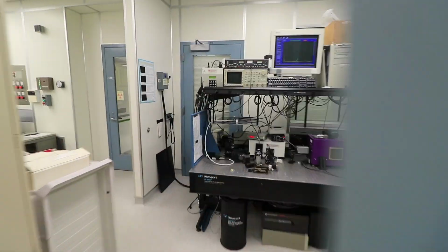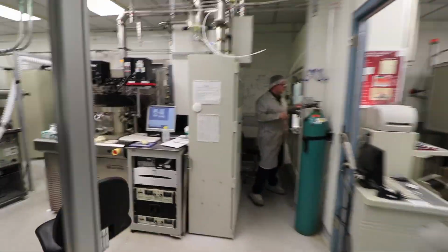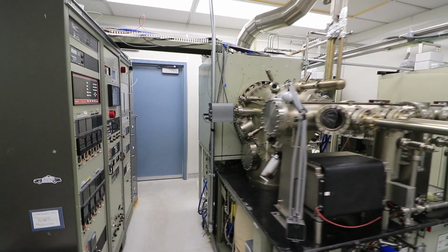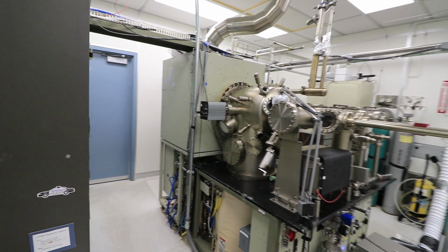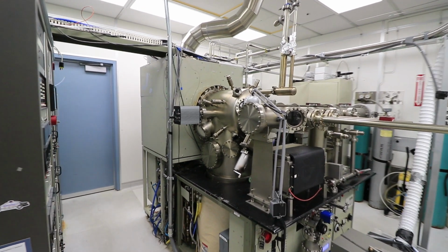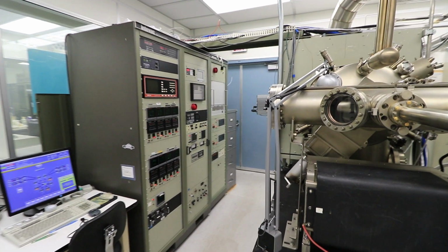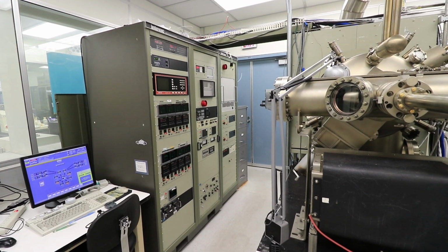A gas source MBE system, an Intevac Mod Gen 2, is dedicated to the growth of arsenic and phosphorus-based 3-5 compounds. The reactor has 6 furnaces containing the Group 3, N-type and P-type dopant elemental sources, as well as 4 gas injectors with crackers for the Group 5 elements. This MBE reactor is capable of growing uniform 3-inch diameter wafers. In situ characterizations, including reflectance high energy electron diffraction, or RHEED, and residual gas analysis, or RGA, allow real-time monitoring and precise control of the growth conditions.